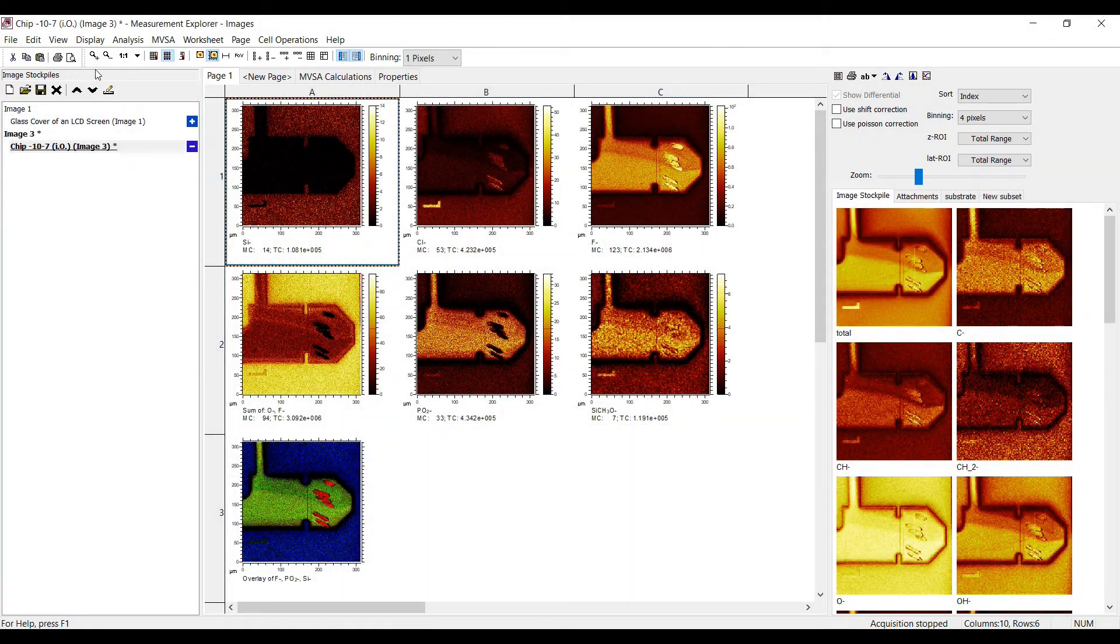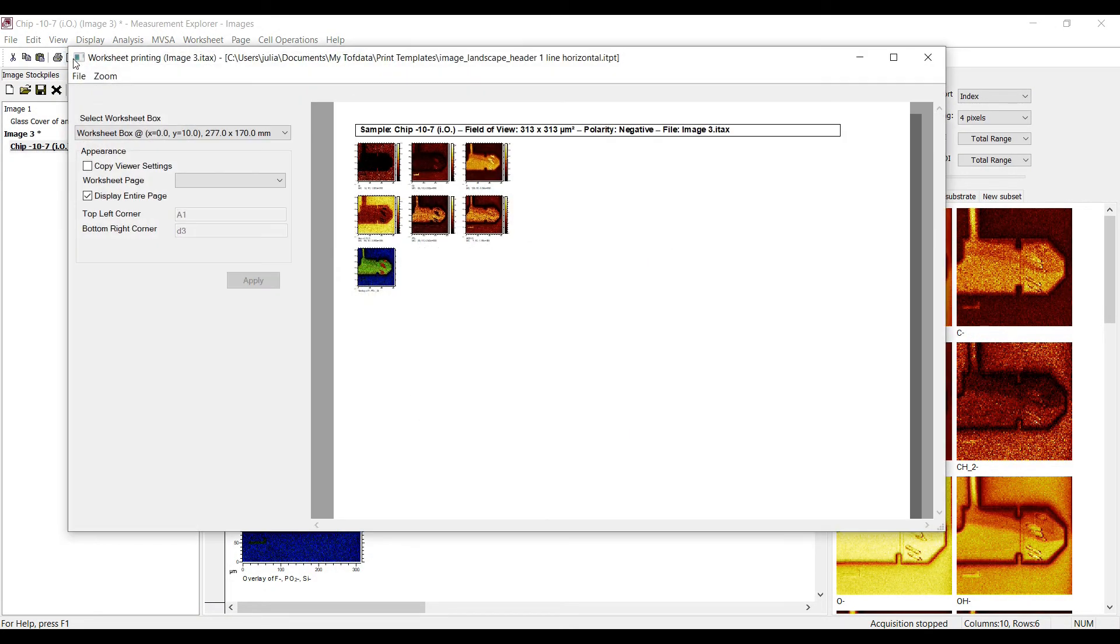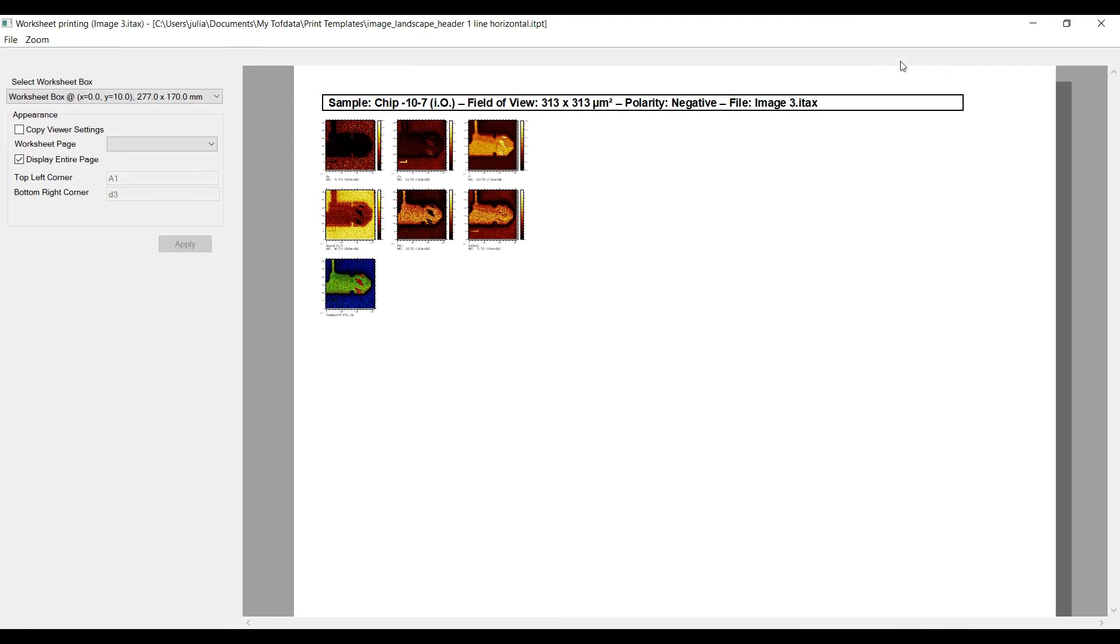The easiest way to bring images from the worksheet to your report is the print preview. You can select a certain range of the worksheet page to be shown in the printout. For this, the respective cell notation has to be used to define the start and the end of the shown range.